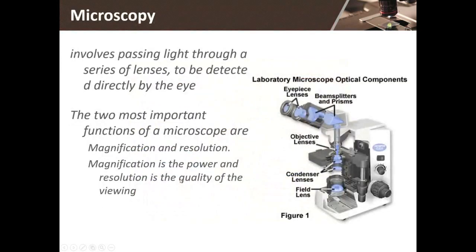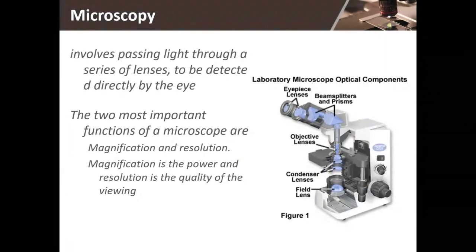First of all, how many of you have ever used a microscope? Okay, so some of you, okay, good. So you'll probably have some sort of remembrance of what I'm talking about, but like I said, you will get your chance someday, I promise. And I realize some of you, it might have been since like 8th or 9th grade biology, which was a while ago.